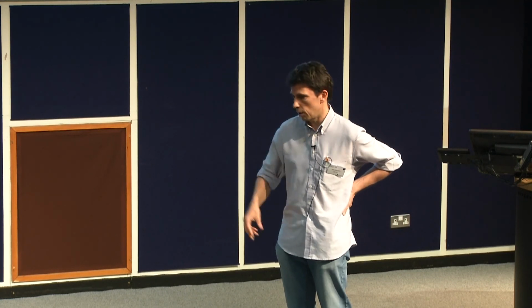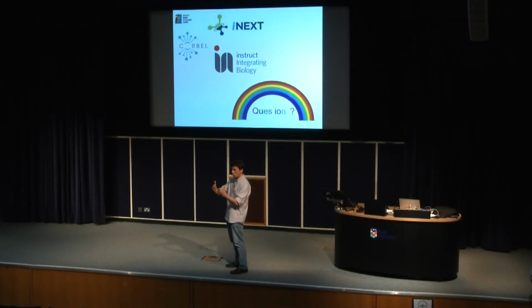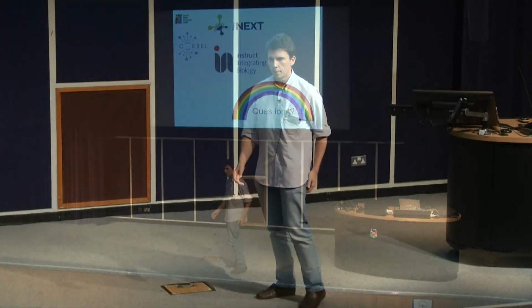So that is my natural second step, and then CL2D from Xmipp. But there are many others, so you can simply try. The idea is to make the algorithms orthogonal to each other. So you apply one step, and then the next one shouldn't have the same goal function, the same algorithm as the first one, because otherwise they are all aligned.